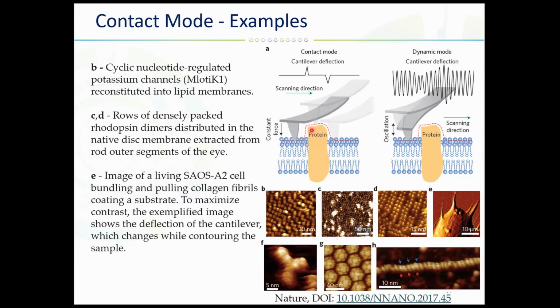So ideally, if we go for dynamic mode, the tip touches the sample only when it goes in these points, right? So it is less damaging for the membrane. So these kind of experiments are called amplitude modulation AFM.